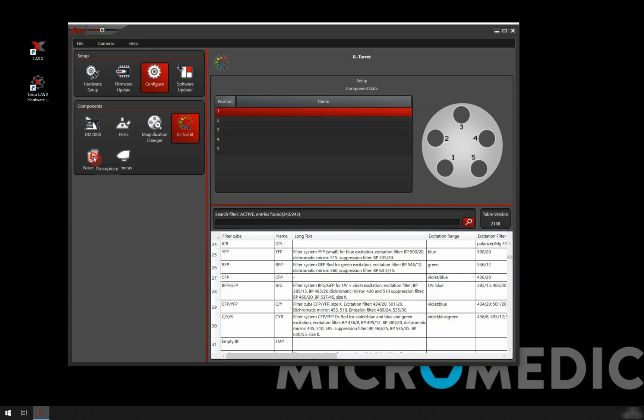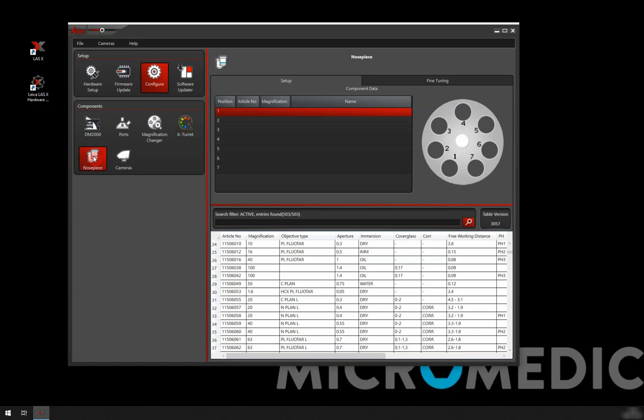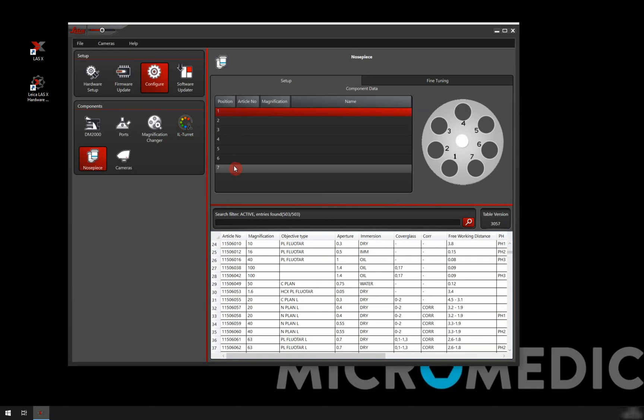We're moving on to the nose piece. For the nose piece, here we see our nose piece. It has seven positions. The DM2000 can come with six or seven.